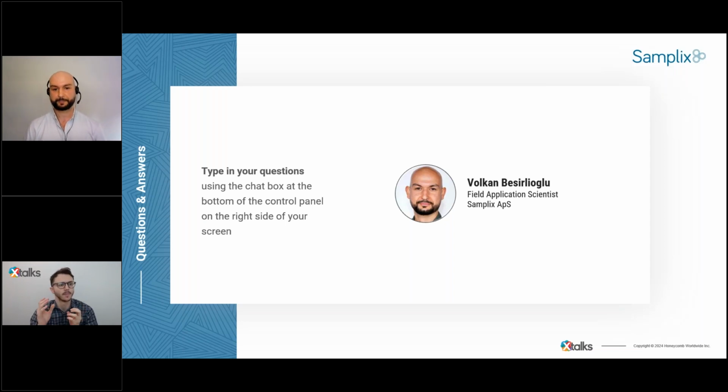Another question here from an audience member is asking if Xdrop sort could also be used for the sorting process. Yeah, actually, yes. Back then in this collaboration, we didn't have the Xdrop sort, but it can be also used to sort. Because we didn't have the instrument back then, we used instead the flow cytometer, the cell sorter. So it sounds like Xdrop sort really helped coming into the process there and being really useful.